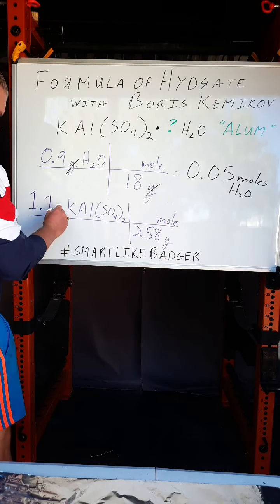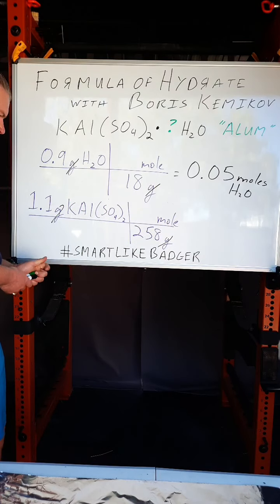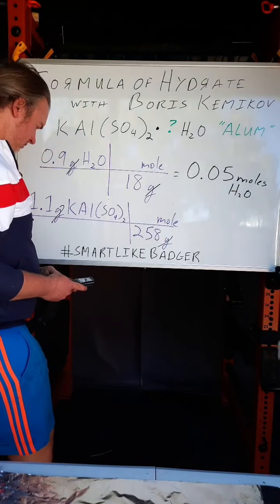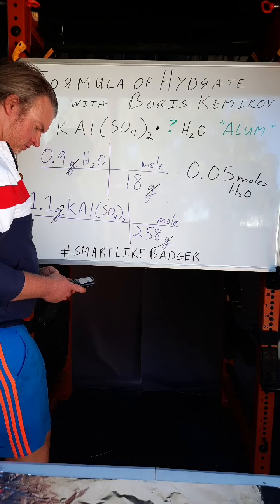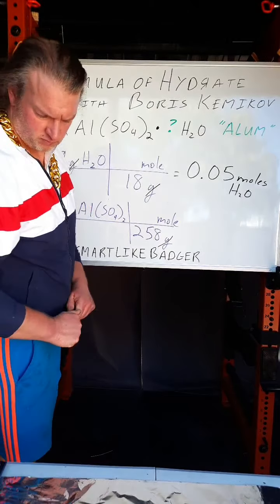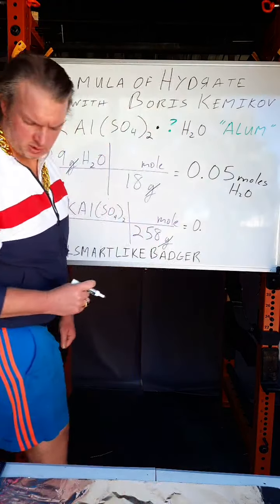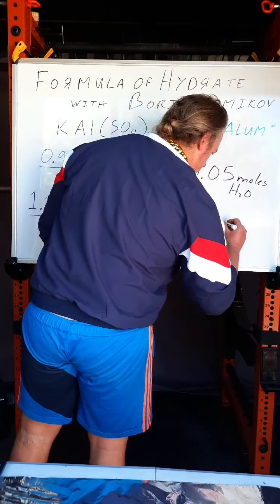Boris is not able to do this in his head. 0.004.